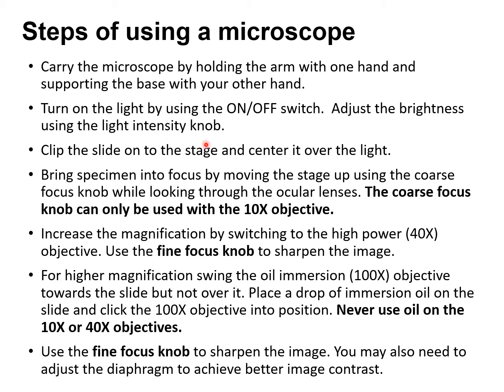Now, as I said, you can adjust your brightness, but never make it too bright because it's going to hurt your eyes. So always dim the light. Now, if you need more light, of course, go ahead and adjust it. But again, don't make it too bright. It's going to hurt your eyes. And then you clip your slide. So you place your slide on the stage and you clip it in between those stage clips that I just showed you.